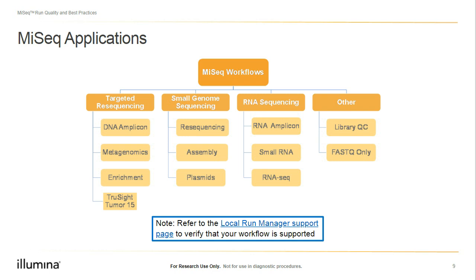The link at the bottom of the slide will take you to the Illumina Local Run Manager support page, where you can confirm the desired application is supported by the software version on your instrument or instruments.